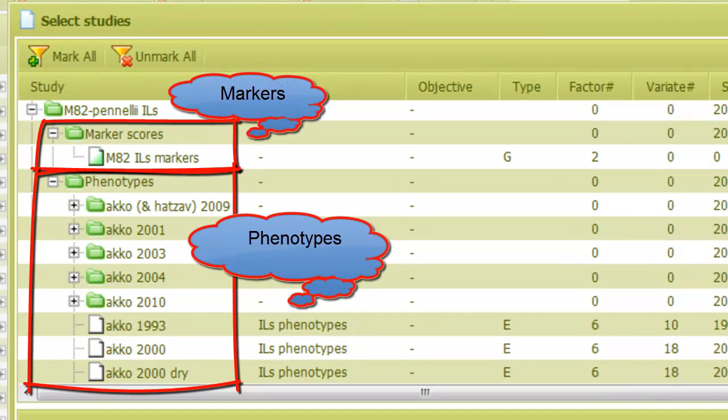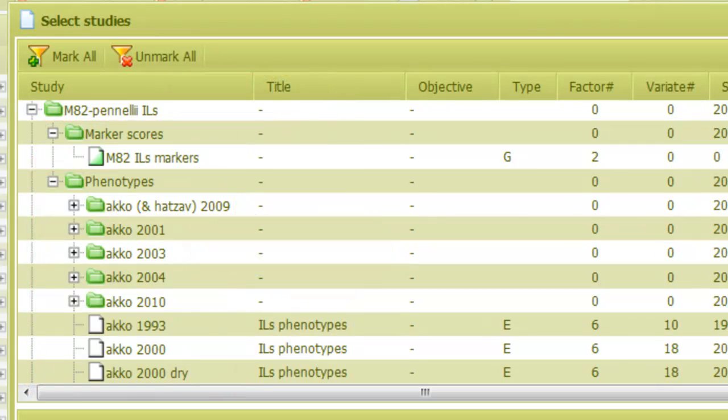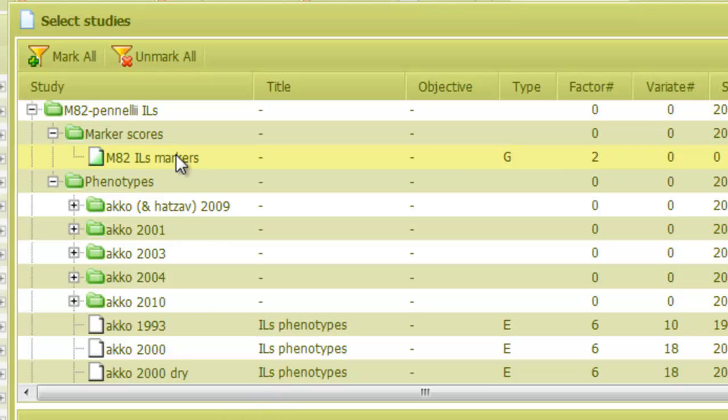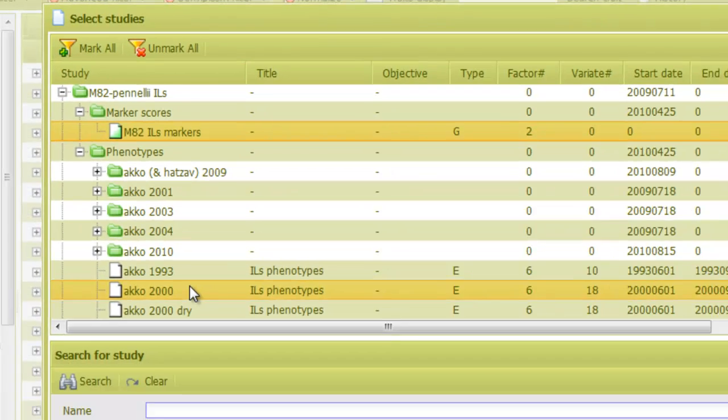To perform a QTL analysis, I need to select a genotype study and a phenotype study. In the marker scores folder, I select the only study that is in there. From the phenotypes folder, I'll pick this study.